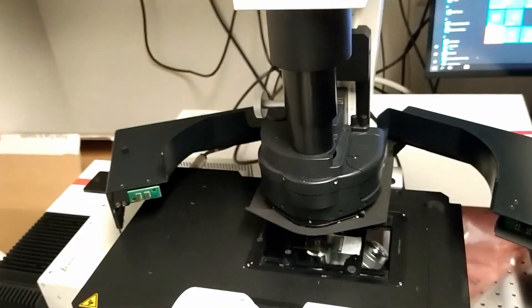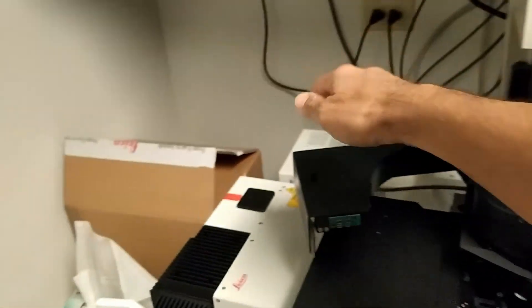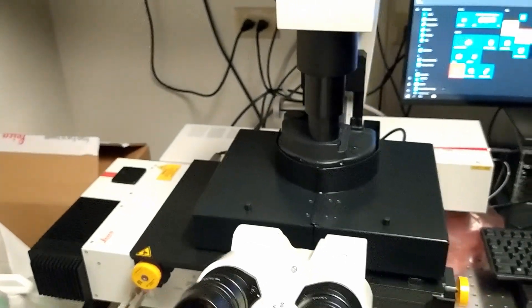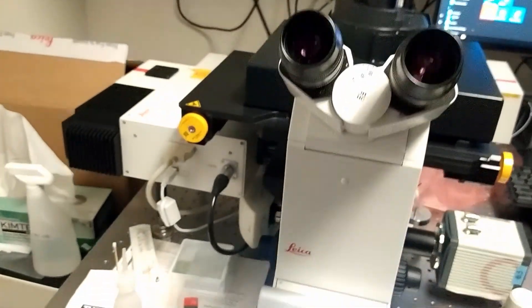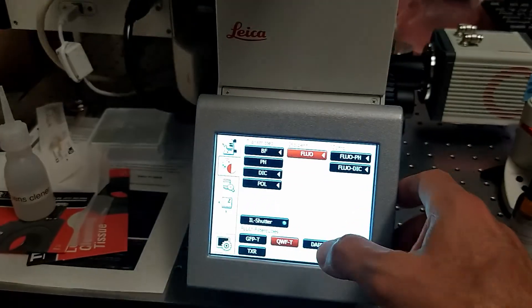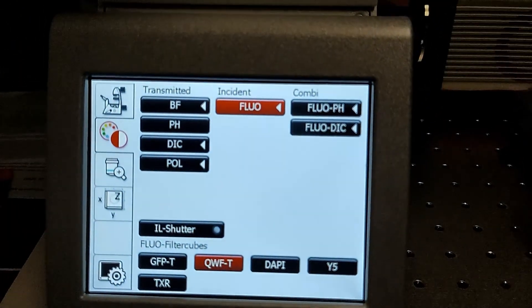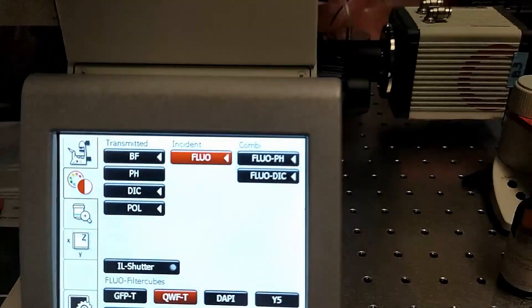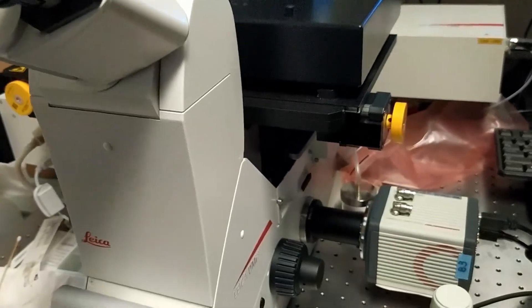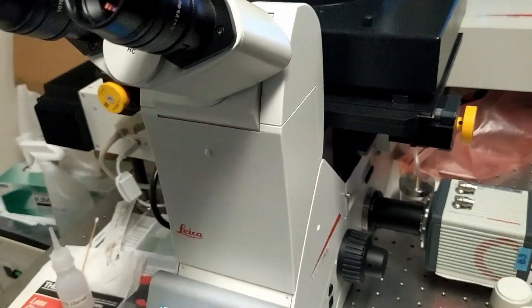Lower the condenser arm and close the safety box. Then come to the touch panel. Under the fluorescence tab, using one of the fluorescence cubes, look through the eyepiece. Adjust the Z position and find the sample, or focus to the sample.